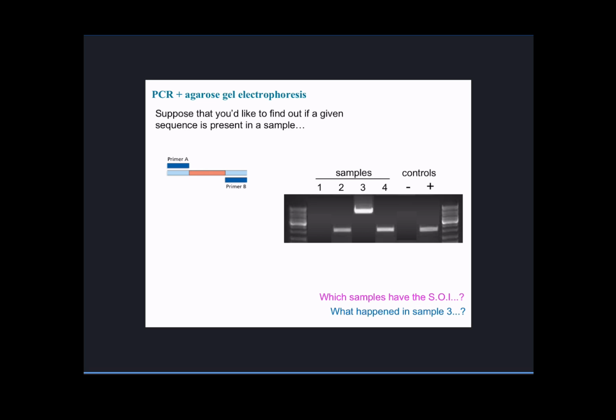When we think about how PCR works, the PCR would not have gone through that exponential accumulation, because you always need at some point each of these amplicons to be amplified in the opposite direction to get that. One template will give you 2, 2 will give you 4, 4 will give you 8, and so forth, right? So for this degree of amplification, you always need both primers binding.